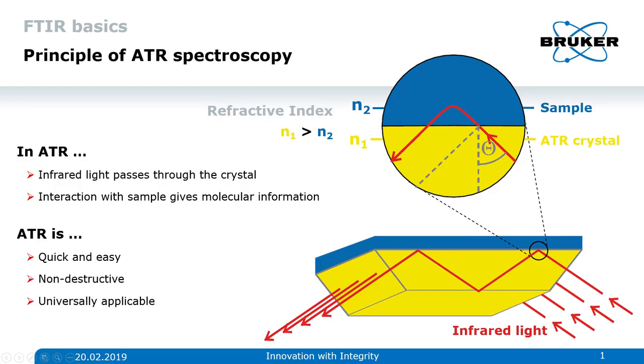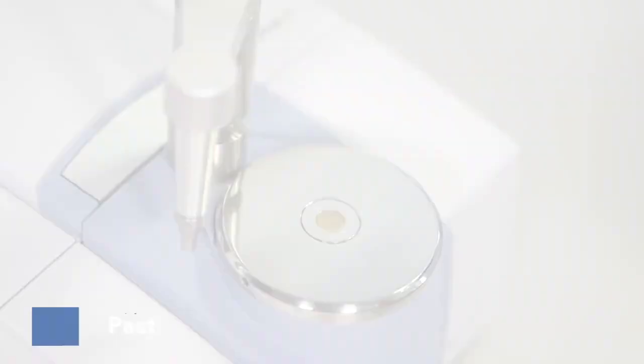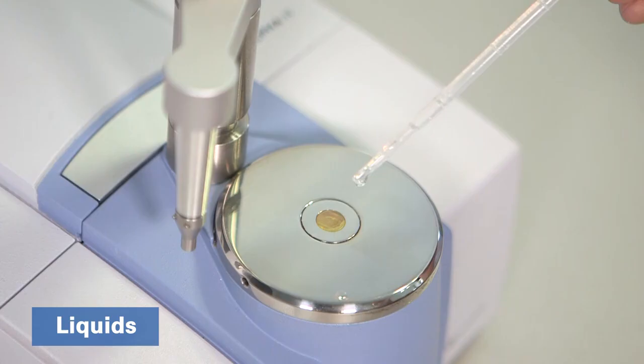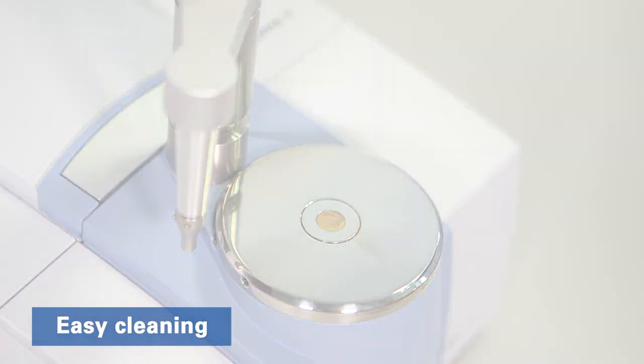This method is fast and easy, non-destructive and universally applicable. Analyze any solid, like powders, pellets or finished products. ATR is also suitable to investigate pastes, oils and other liquids. Cleaning the ATR accessory is very easy and absolutely hassle-free.